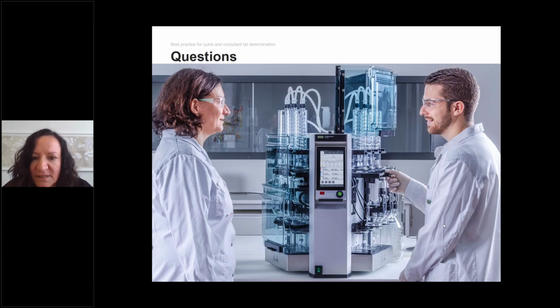Are you also using PTFE inserts in the E500 to reduce solvent content? In the previous version of the instruments, we had expansion elements to get rid of solvent volume to make the cycles faster. For the new instrument, we don't have these types of inserts anymore because the chamber volumes are a lot smaller and there's no need for that anymore.